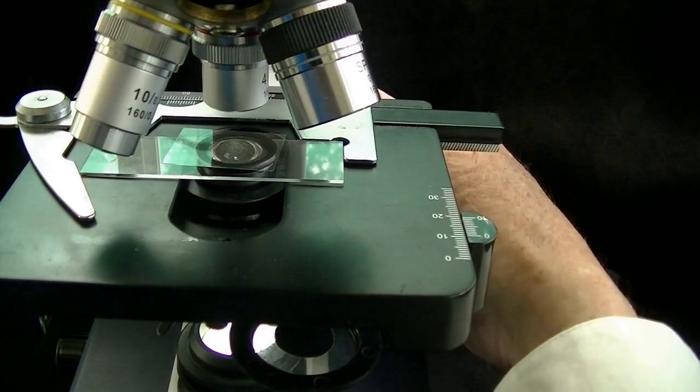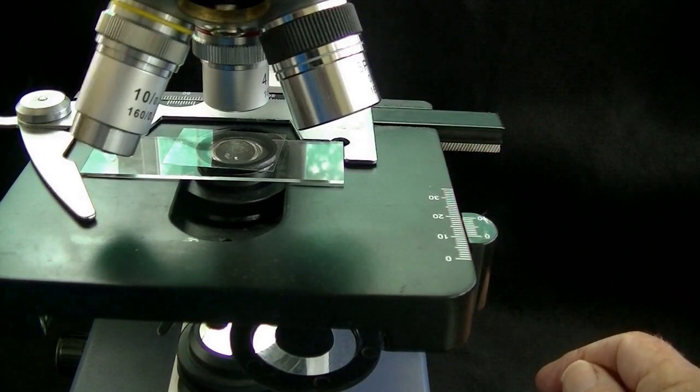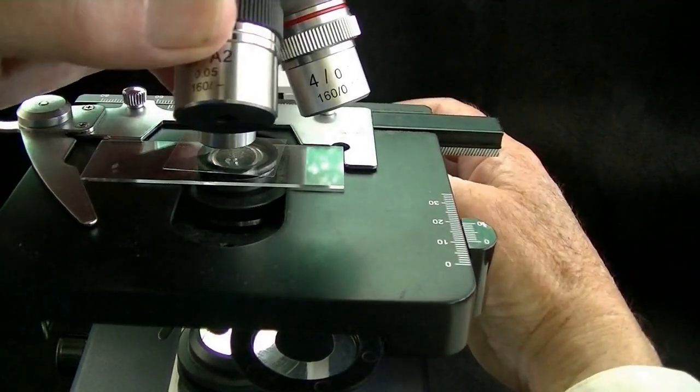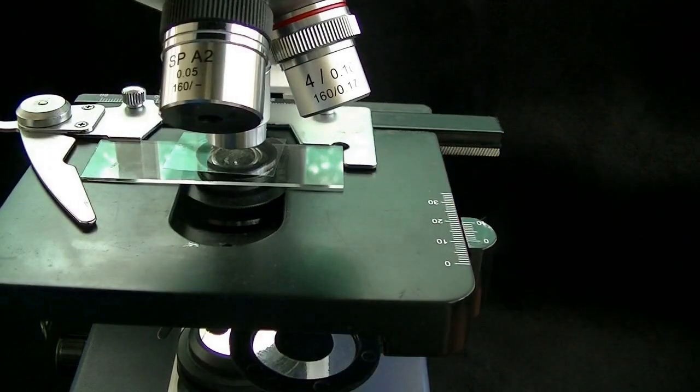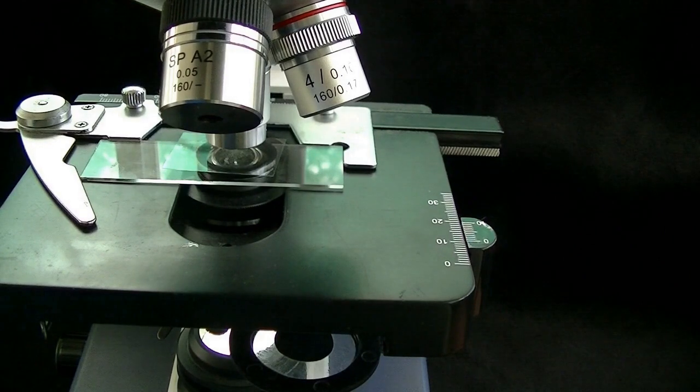So this slide is thick enough for a 4x and a 10x objective. It just has enough working distance. The advantage of the spacer slide over the depression slide is the volume being 10x greater is better for looking at relative populations.